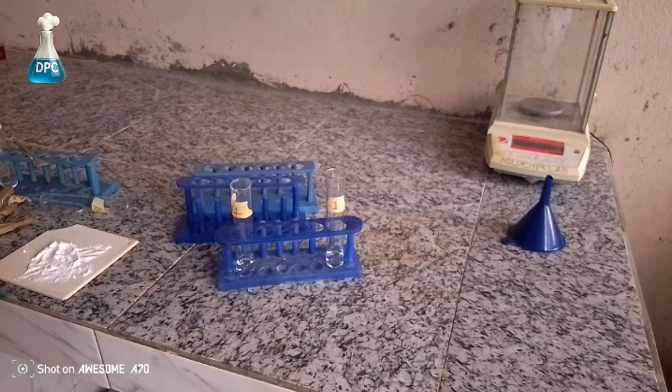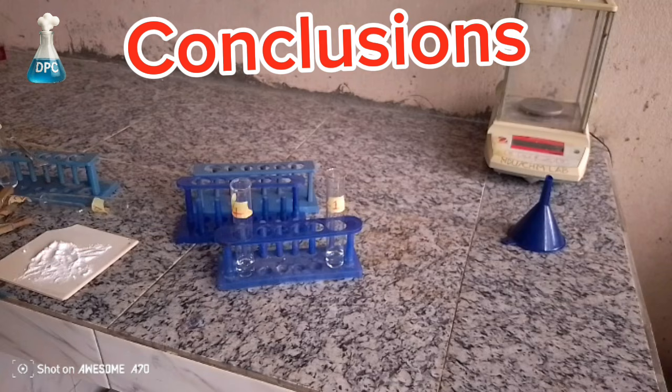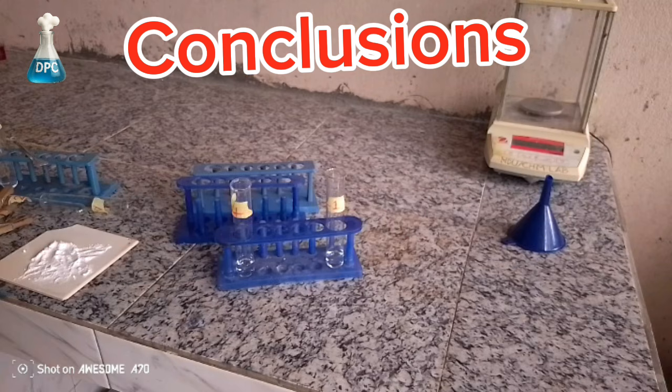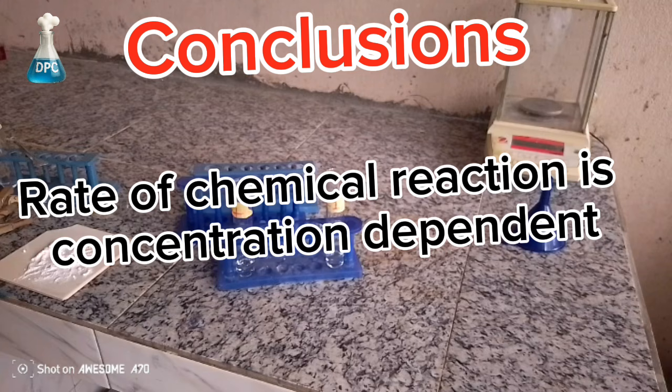From this reaction, we can now make the following conclusion. Under effect of concentration, at higher concentration, the rate of chemical reaction becomes faster. It then means that the rate of chemical reaction is concentration dependent.